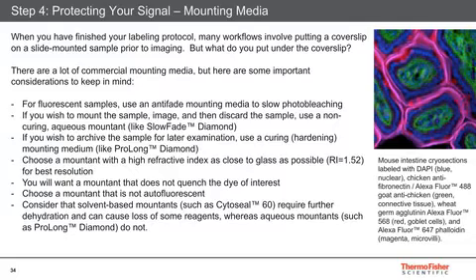Refractive index refers to the bending of light as it moves between substrates. For instance, the light goes through your objective, the glass lens, and then it bends slightly in the air, and then bends again in the glass, and then bends again in your antifade mounting medium. So you want something that's closest to glass, with a refractive index as close as possible to 1.52, such that there's less bending. All that bending of light means you lose intensity and lose resolution. And usually you want the brightest signal you can get and the best resolution possible.